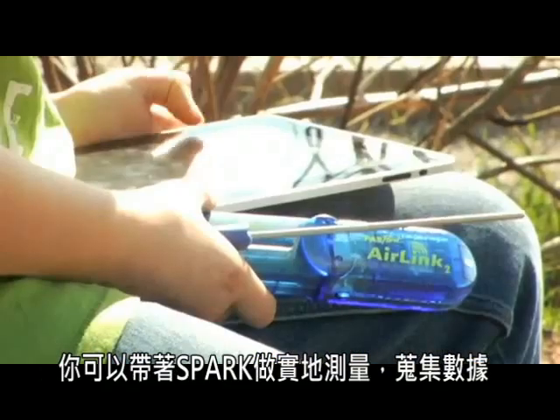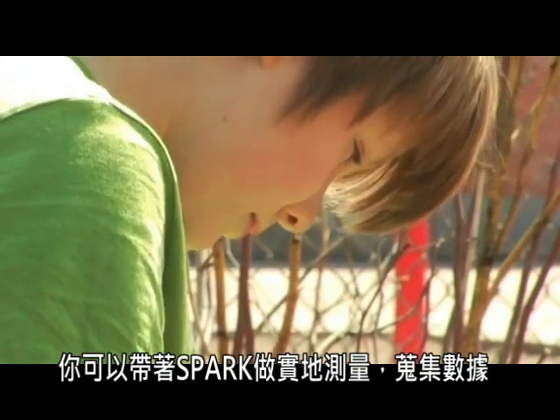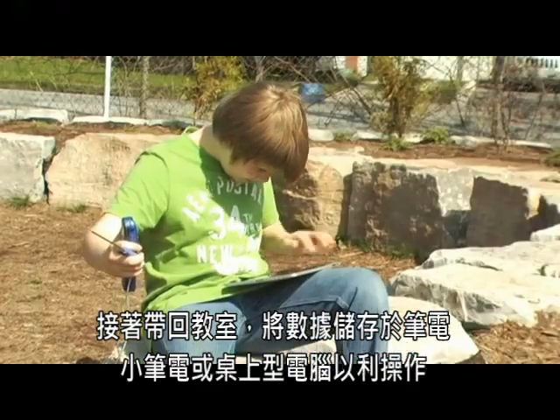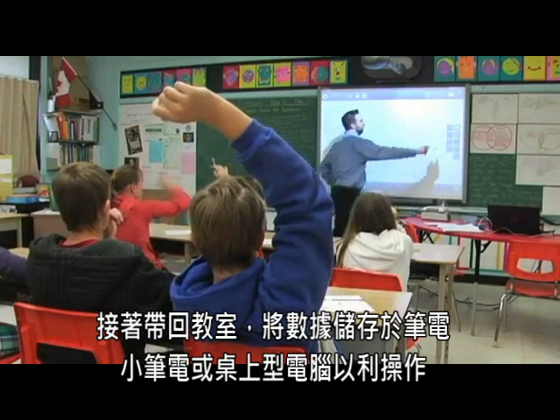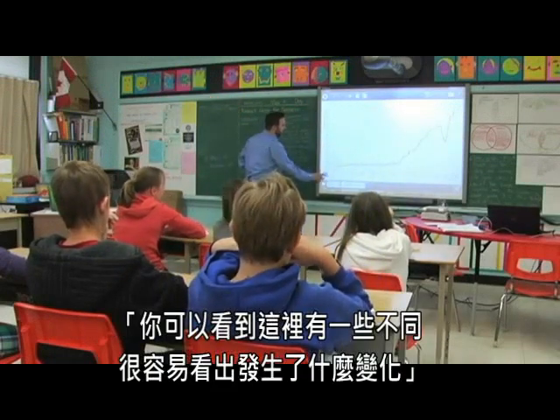Sometimes you can go out into the environment with a Spark unit, collect the data, bring it back, and then show it on a laptop or netbook or even on a desktop, and then display it onto a smart board. Then you'll see something look a little bit different, and it's easier to see what's going on here.